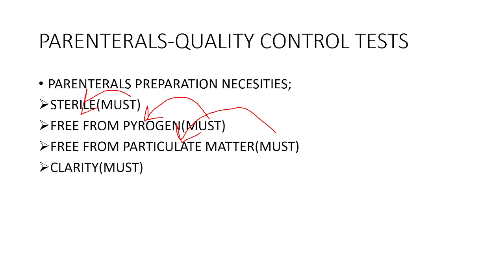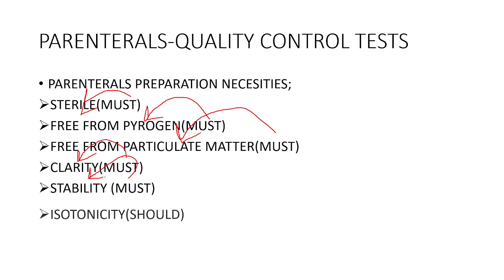Next, the parenteral solution must be clear. Next, the parenteral solution should be stable. Next, the parenteral preparation should be isotonic. So these are the necessary properties of the parenteral dosage forms.